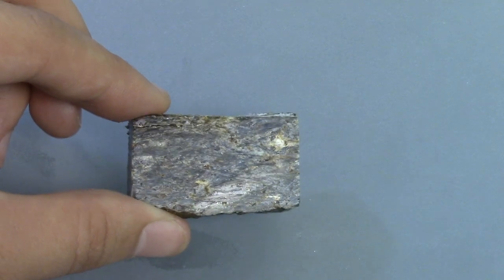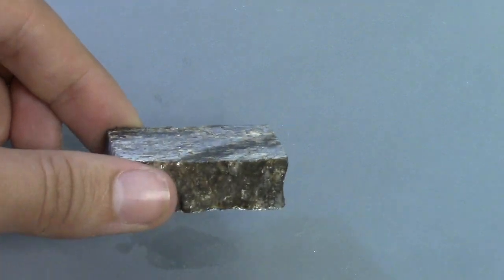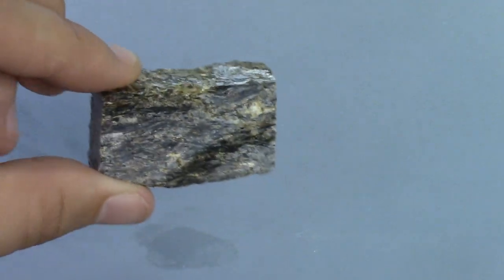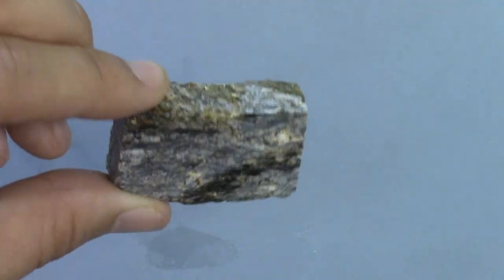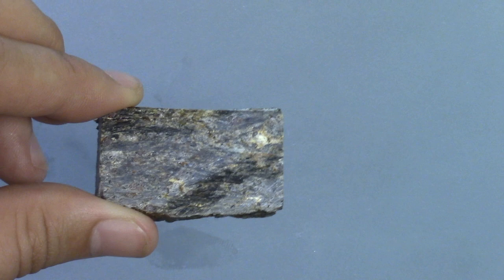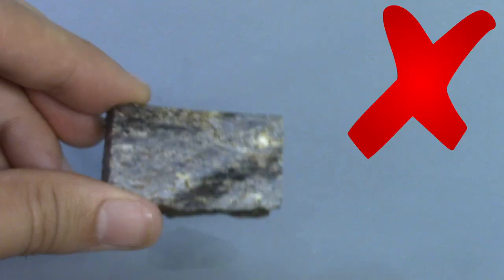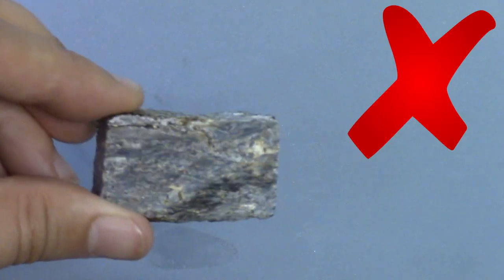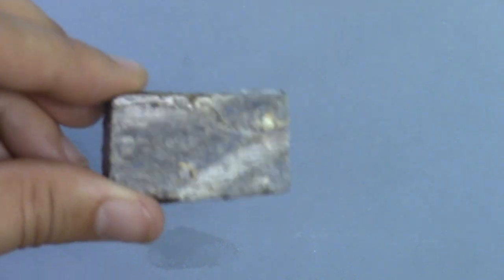And then the last one is a similar example and again not enough time was spent trying to flatten the surface to begin with and so only the surfaces that were sticking up the highest have been polished flat and so there's only two stripes of reflective surface there so this one also would need more work.